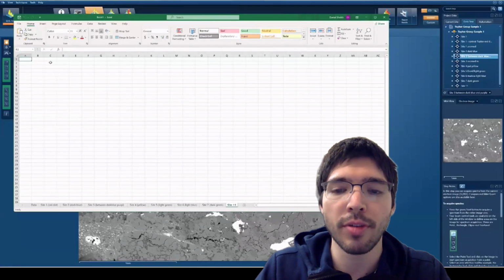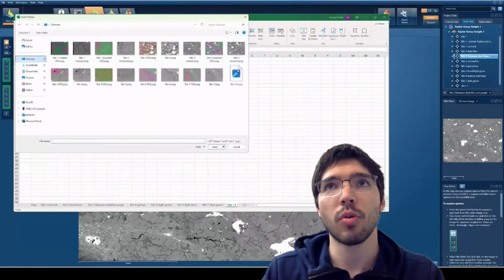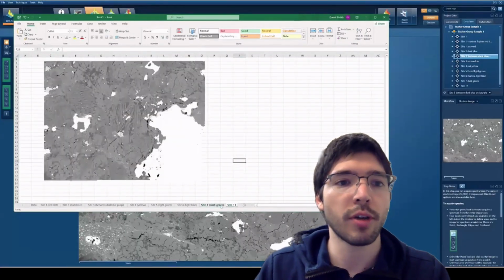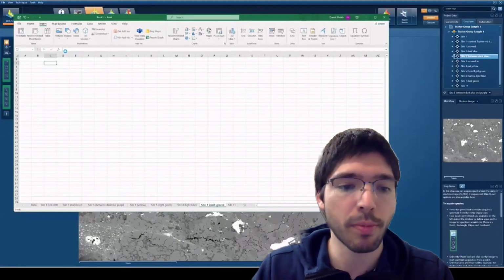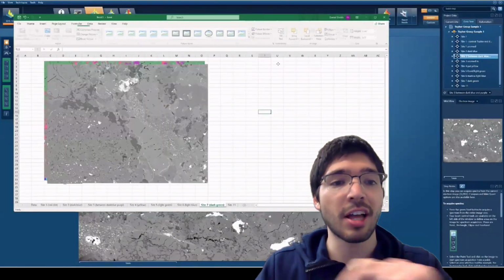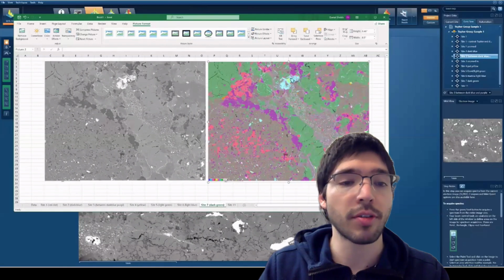The reason it falls off a little more with a scanning electron microscope is because of your probe current. On the electron microprobe, your probe current is at a fixed value when doing EPMA. With a scanning electron microscope, your probe current is a lot lower, and that has a huge influence on the range of your oxide percent totals, believe it or not.